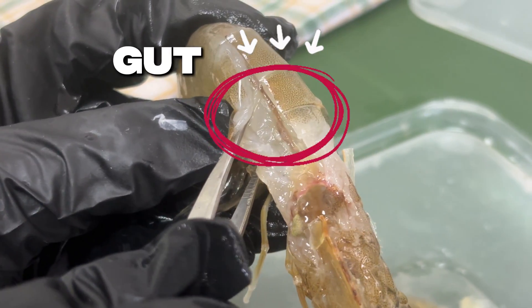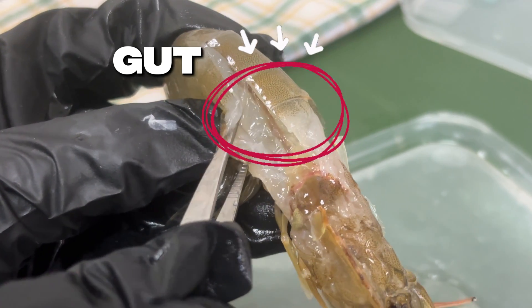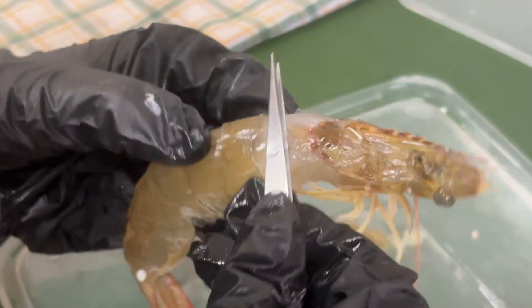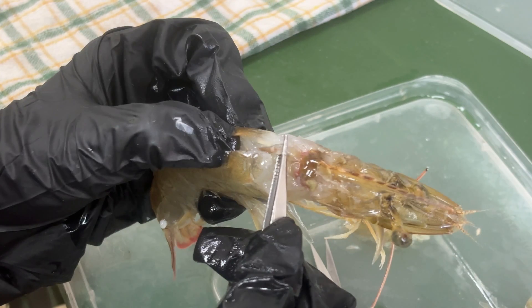Here is the shrimp's gut. It runs along the back and helps transport and digest food, working closely with the hepatopancreas. When we clean shrimp, this is the dark line we usually remove. The gut is actually connected with the hepatopancreas.